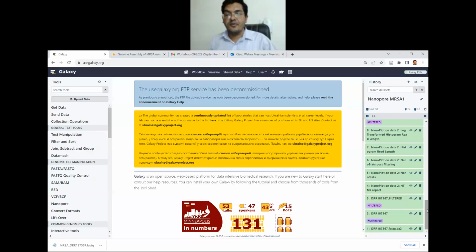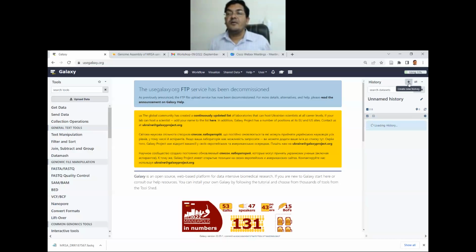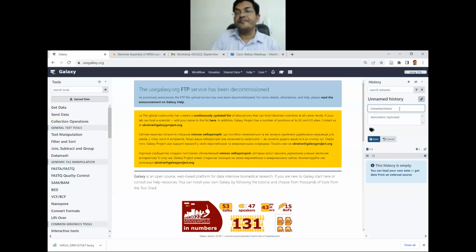Probably I'll go through the presentation again, because to do it online is not possible, since each of these steps takes time. But for you, I'll create a new history and at least show you how to upload the data before we close today. So you create a new history, you click on the plus button, you get this unnamed history. Let me put the name as next gen and nanopore. The name has to be unique, and you say save.